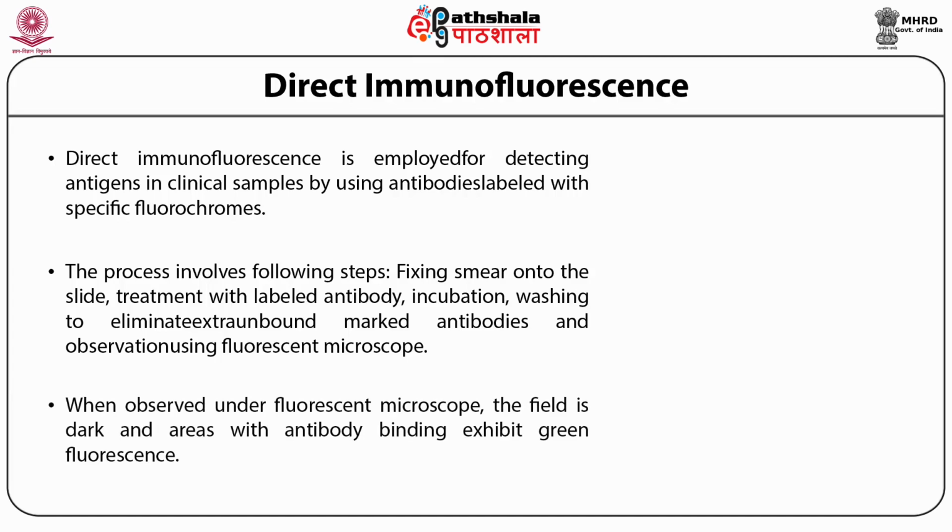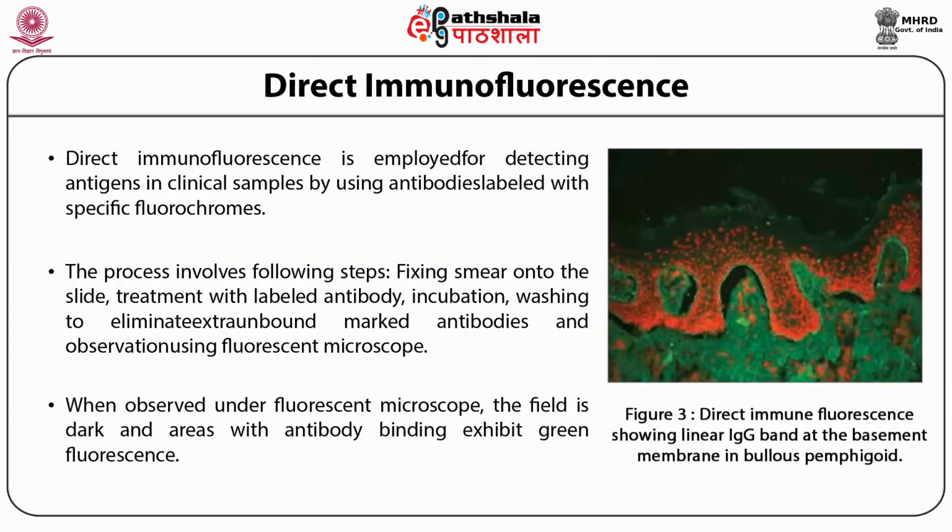When observed under a fluorescent microscope, the field is dark and areas with antibody binding exhibit green fluorescence. The figure also shows the direct immunofluorescence having a linear IgG band at the basement membrane in bullous pemphigoid.